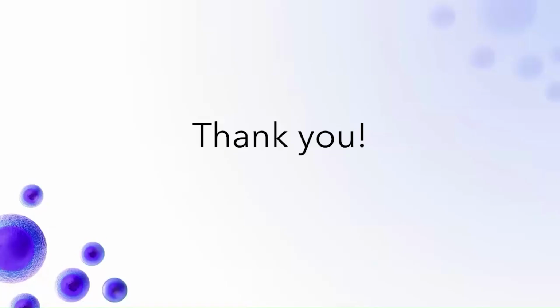So it is a single gas input, but I know that there are some users that are interested in doing those hypoxia studies. There are some users that do it based on media methods. And then there are also options to have external gas mixers, where essentially you have a gas mixer that is incorporating the tri-gas and then feeding it into the Sero with just one line. But the instrument itself only has one gas port.